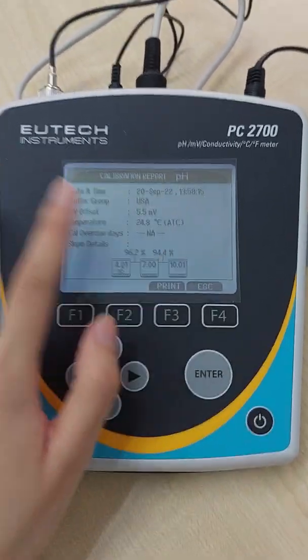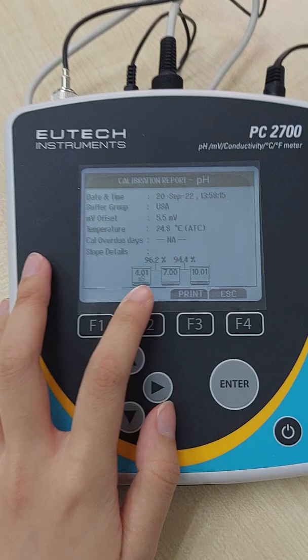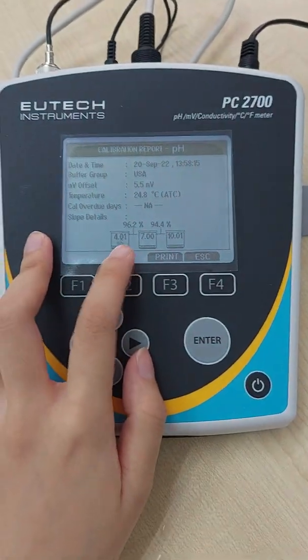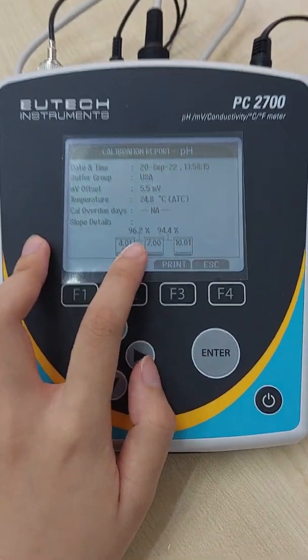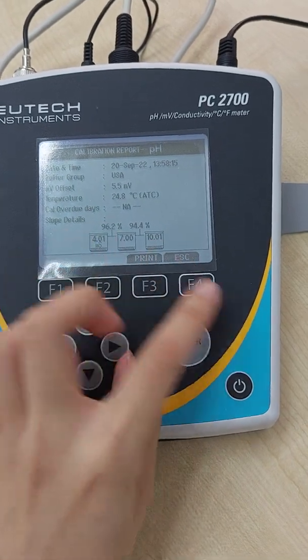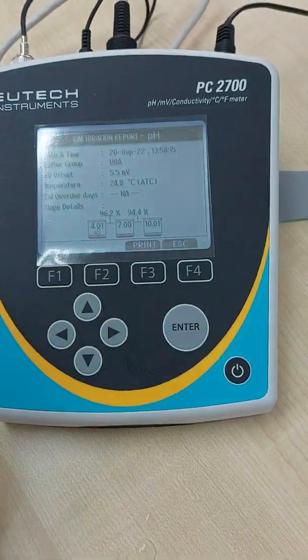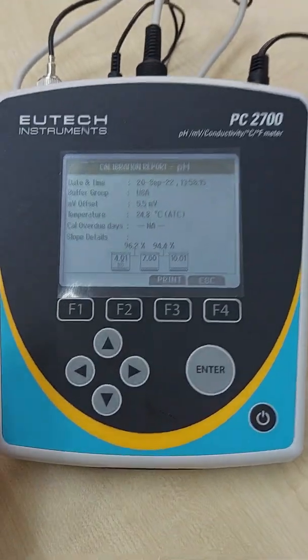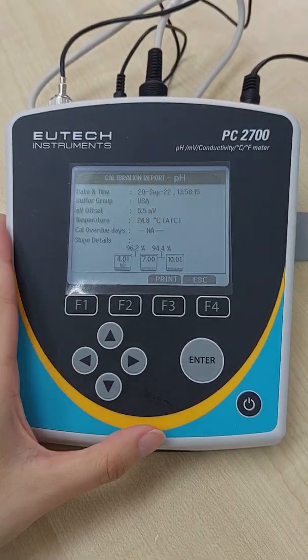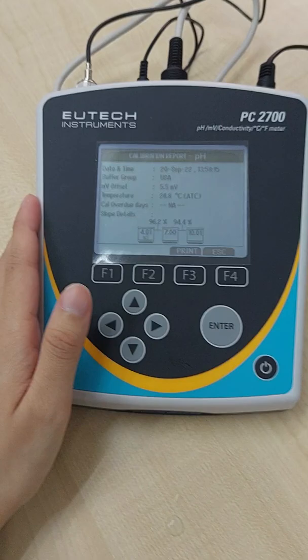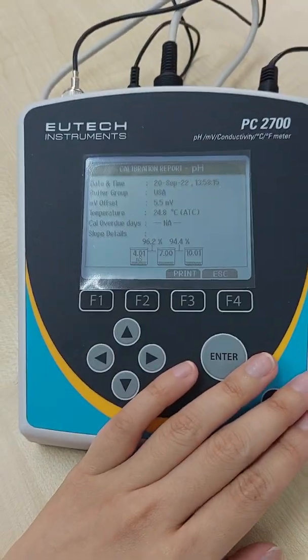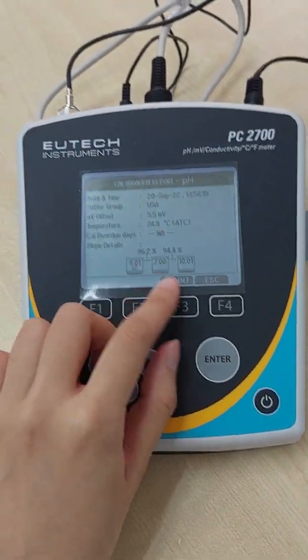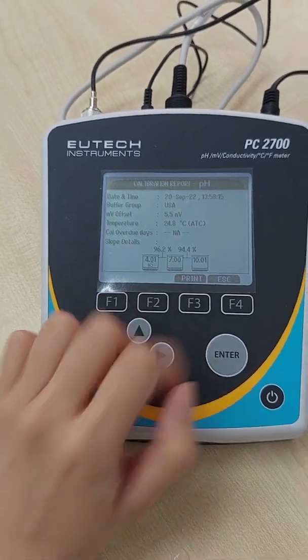Report. This will be your last calibration report. Make sure every day your calibration, the range has to be between 92% to 102%. If it's out of range, you can change a new buffer solution and then redo the calibration. If it's still out of range, that means that the probe performance is not that good. So a good one will be between 92% to 102%.